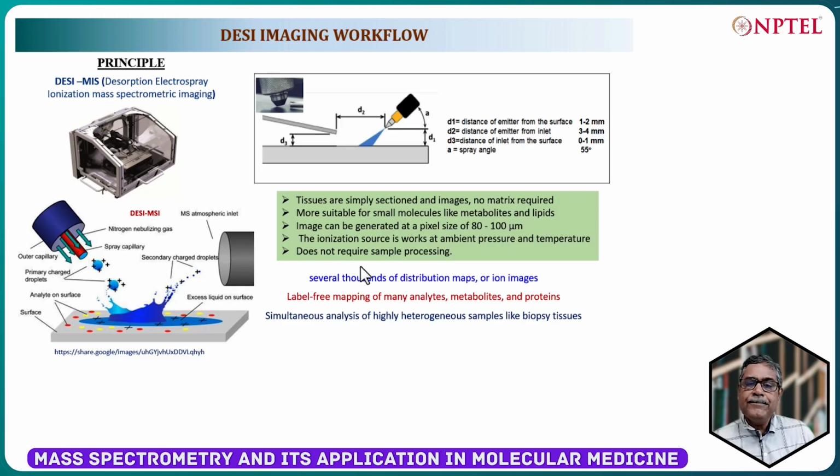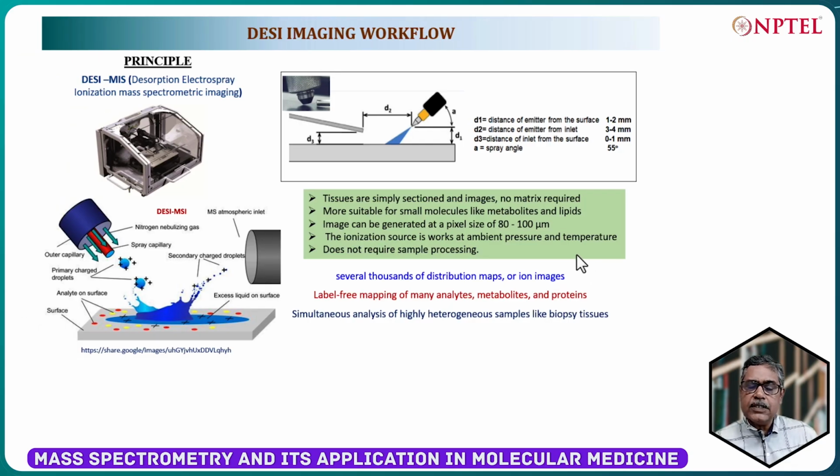The ionization source works at ambient pressure and temperature. Okay, this does not require any sample processing.